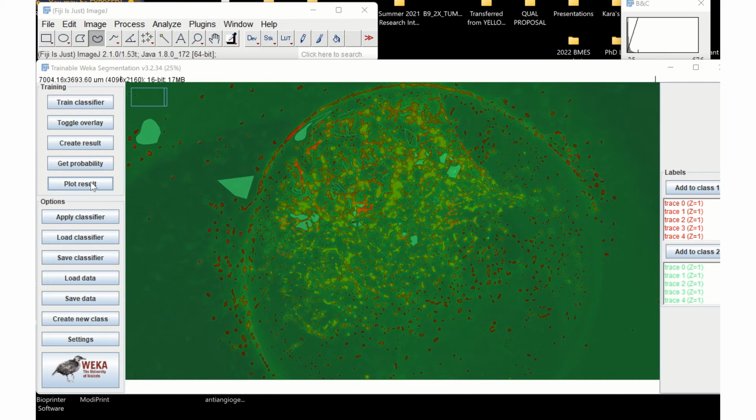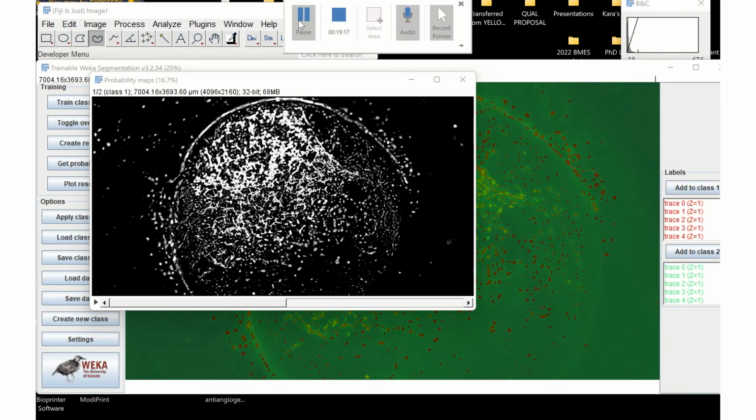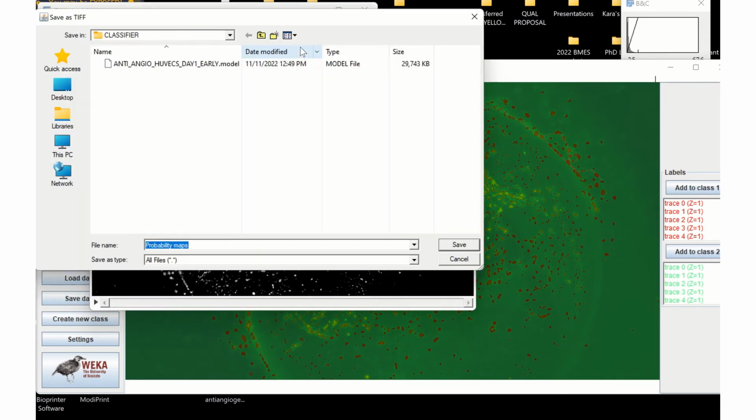So now it's time to get our results. So we're going to go ahead and click get probability. And this takes about 3 minutes. This is fantastic. It looks beautiful. So what we're going to do now is save this. So file, save as, TIFF.